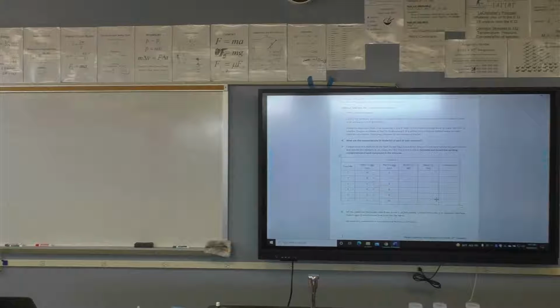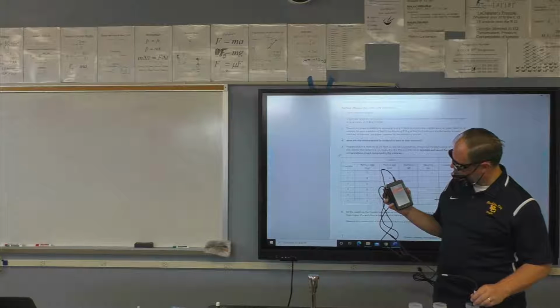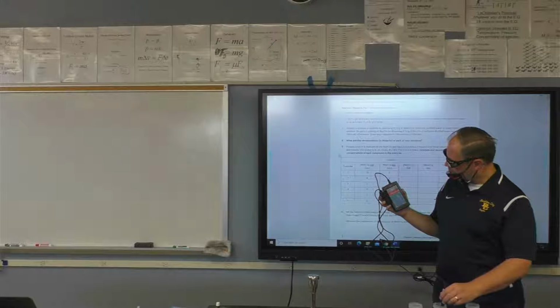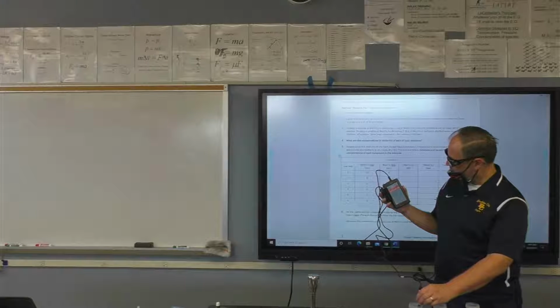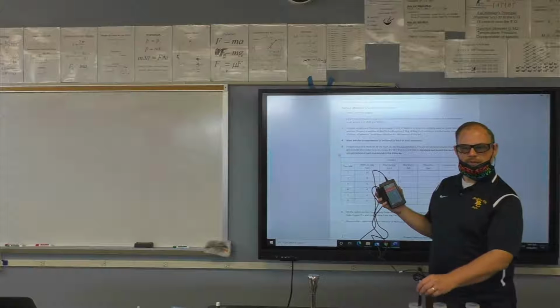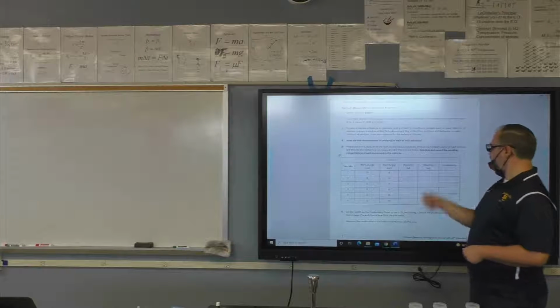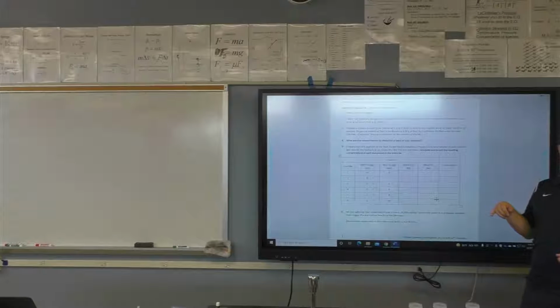Yeah, cool. So let's go ahead and test our conductivity meter. And again, just by moving it through the air, it's actually picking up some ions. So I'm at 202, 217, 250. These do take a little bit of time to warm up. And then 2,500, 2,600, and 3,600, 4,400, 4,500. Make sense? So that's what you're going to do. You're going to make your solutions, and then you're going to plunge the conductivity meter into your solutions and write down their conductivity. Okay.